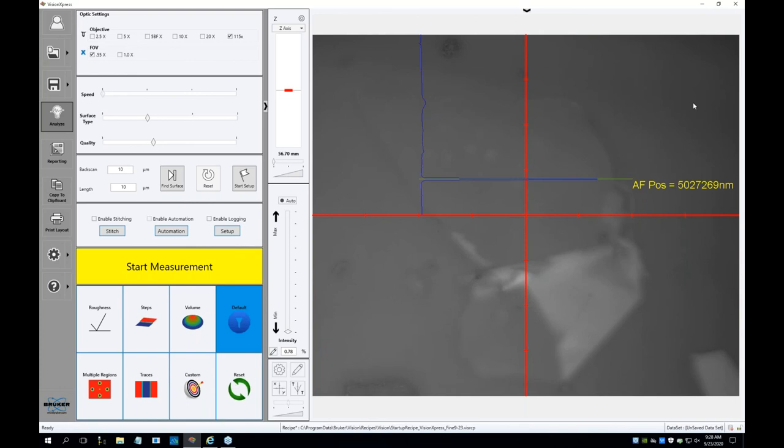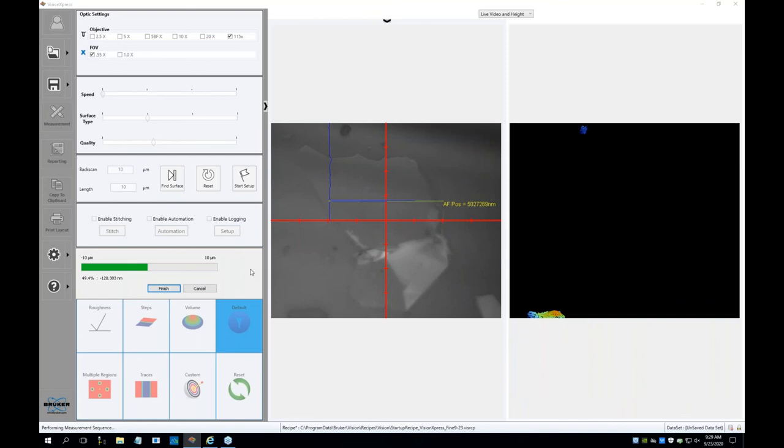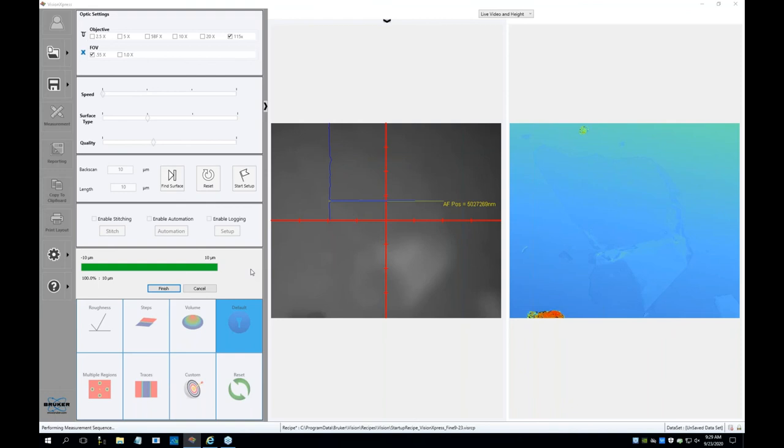So we did both. White light is not enough, so we need PSI, but due to the fact that this light at the larger scan range is not enough to measure PSI only without phase jumps, we do the combined mode. So this is exactly the mode I've shown here, which consists of a vertical scanning, but still using phase information such that we have sub-nanometer vertical resolution. So we can combine a large gap of a few microns or tens of microns while still keeping sub-nanometer vertical resolution. So combining vertical scanning interferometry and phase shifting interferometry.